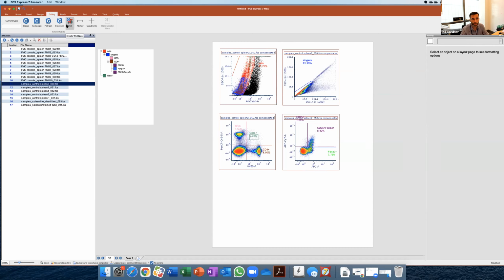Exactly. So I would recommend maybe trying with other tissues where you have more cells. Again, this is going to be different because the titer of each antibody may be different. But you can see, look, maybe the tissue is not that different, and just do all the tests with the washes and the panel, and try to optimize the panel with a more controlled sample where you have more cells.